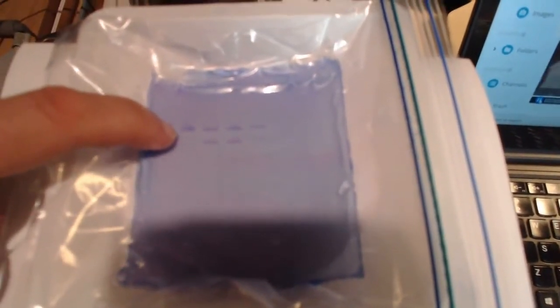What I didn't have, but what's normally run on here, are size standards. So we have DNA cut with a restriction enzyme, and we know the size. This would be a higher number of nucleotides, lower number of nucleotides. The smaller fragments run faster through the gel. The larger fragments run more slowly.